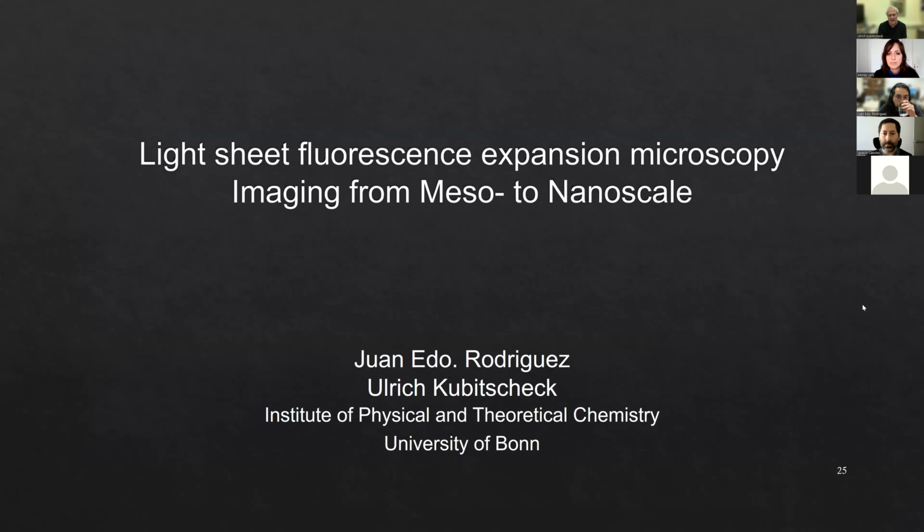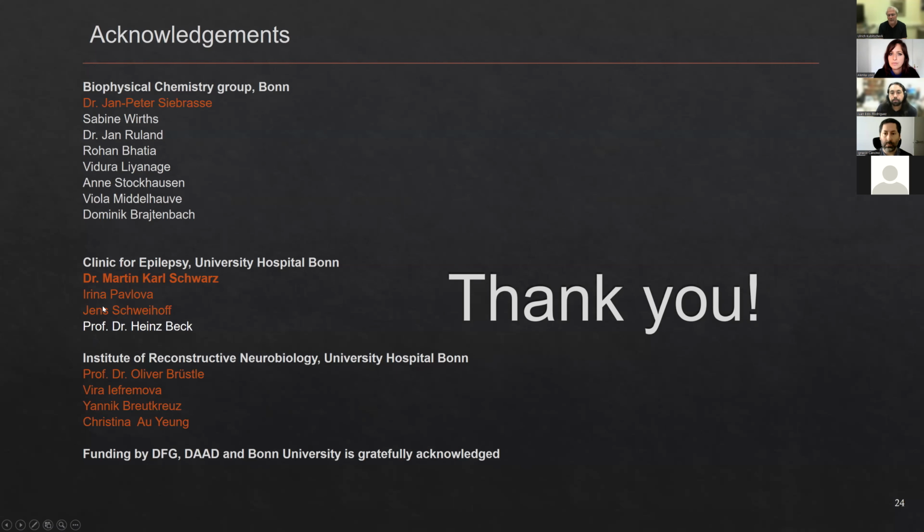So, for example, to examine samples like fish, we have one instrument where we look at the development of zebrafish. In that case, to optimize the penetration of the light into the sample, we use 2-photon excitation, but it works also with single photon, but then you might harm your sample. I mean, these are the normal cases.